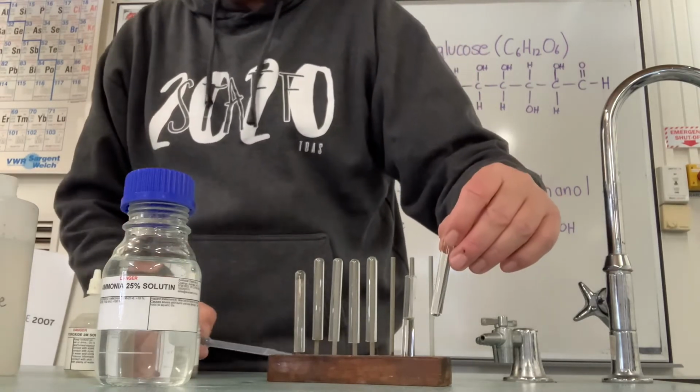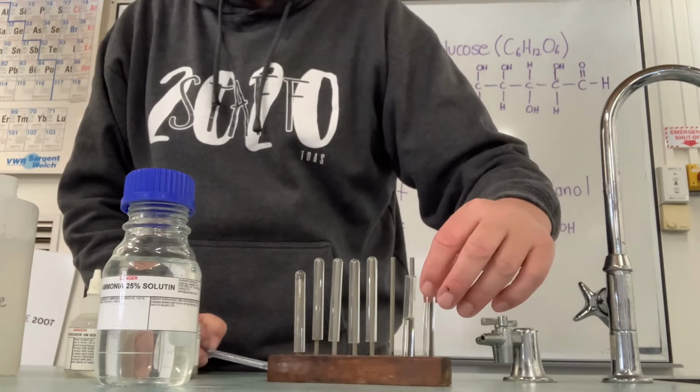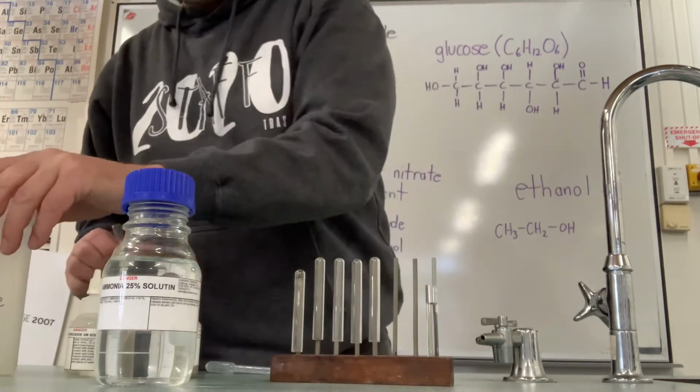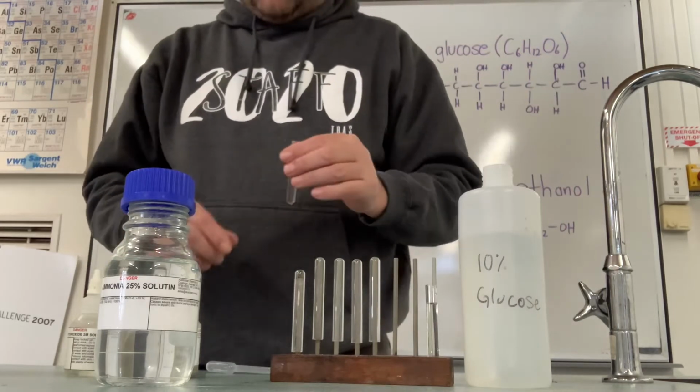This reaction does take a while, and what I'll do in a sec is grab a beaker of just warm water, just to speed up the reaction a little bit. So that one there on the end is the glucose. Put the glucose next to it so I remember.